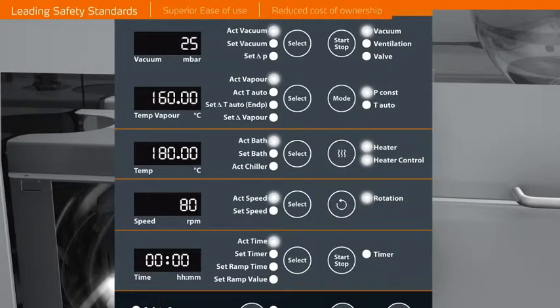An over-temperature sensor stops rotation in the case of any uncontrolled heat-up, shuts off, and lowers the bath and releases vacuum. A safety cut-out feature will prevent any over-pressure situation caused by glassware breakage or a defective vacuum circuit.